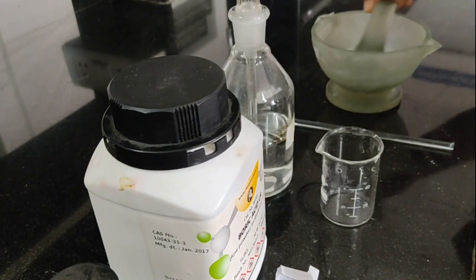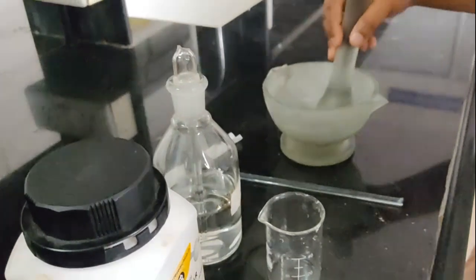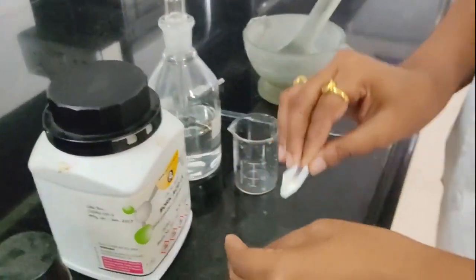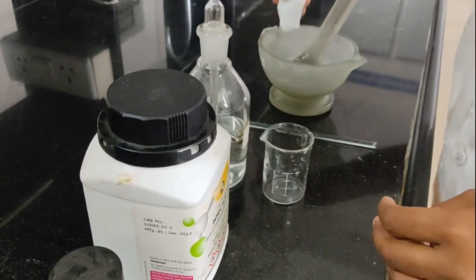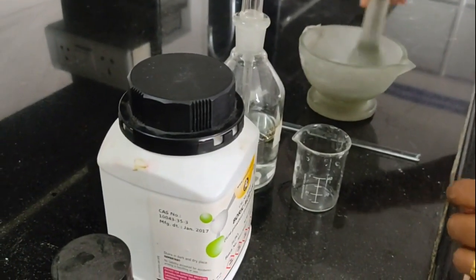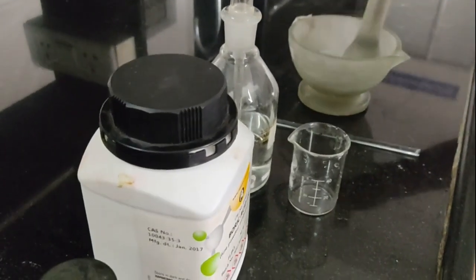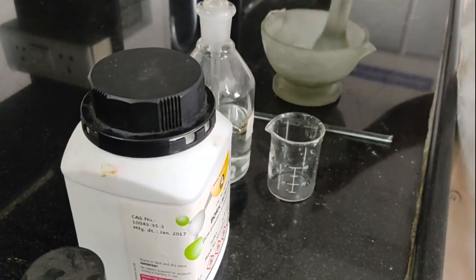After proper mixing of these iodine crystals into the alcohol, now I am going to add this boric acid into it. And after that it is again properly triturated till its complete mixing.